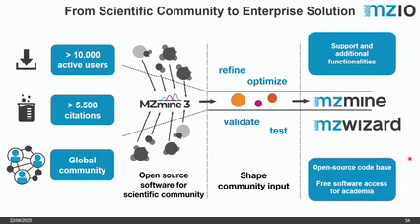If you're a developer, we are also trying to get your contributions. For example, if you have some idea for more specific processing that you need for your application, since the software is completely open source, you can download the source code and make some modifications. In the end, we also really like to help you get everything running and maybe even integrate it into the full mzmine project, so other people can benefit from it as well.